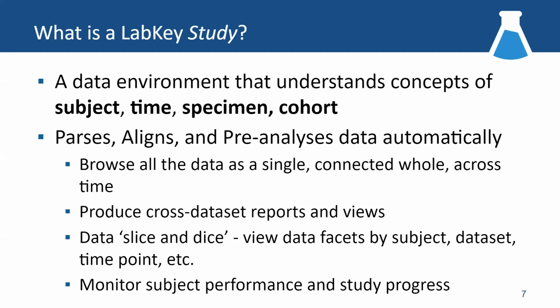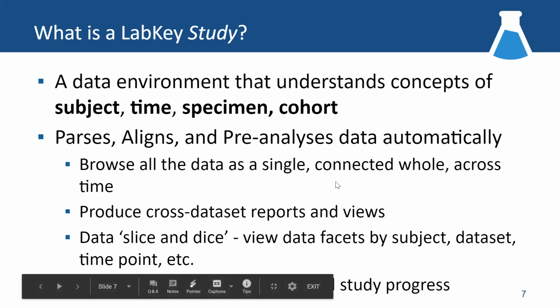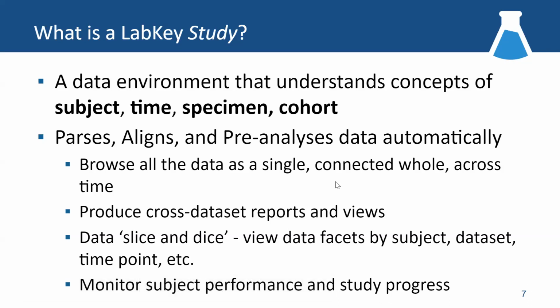It allows you to do sophisticated querying of the data, what we call the slice and dice side of analysis, where you can just look at one facet of the data, et cetera. And it also lets you monitor how your study is progressing. Are you 50% done? Are you 10% done? Are you finally done and ready to present it?